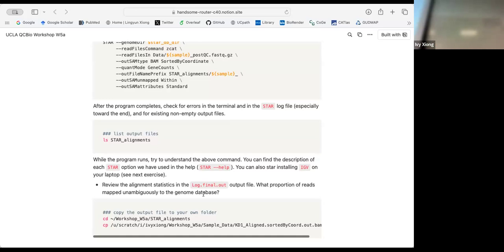What does it say? We were just looking at it, and everything seemed fine.